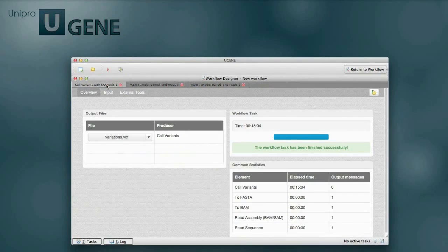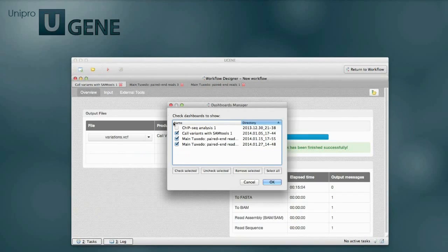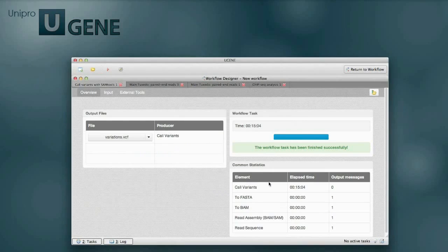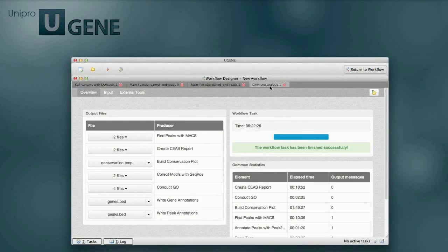Even a closed dashboard can be restored using the dashboard's manager. If you don't need to keep a dashboard, you can remove it with all produced data using the manager.